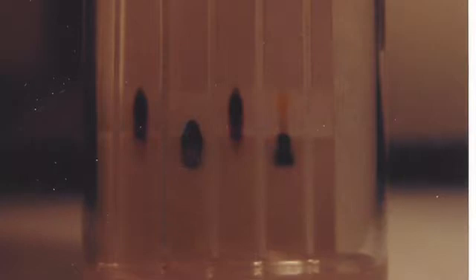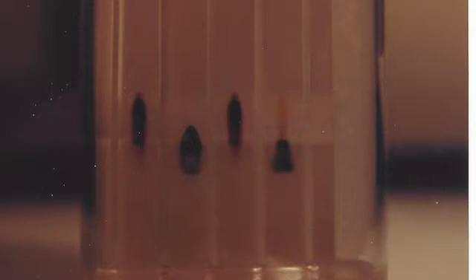Okay, at this point the solvent has climbed just a short distance up the plate. You can see the solvent line at the top of the black spots. You can see the first on the left has climbed up quite a bit, and if you look very carefully, you'll see the beginning of separation down near the bottom of that black spot. It's a little bit purple. The second spot isn't very soluble in the solvent and isn't moving much, and you don't see any separation.